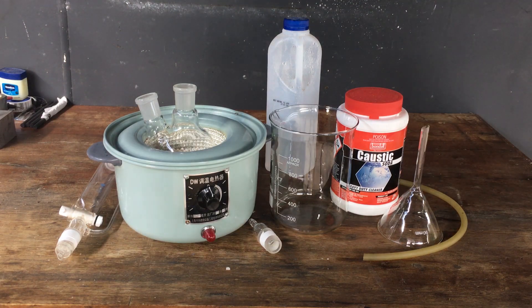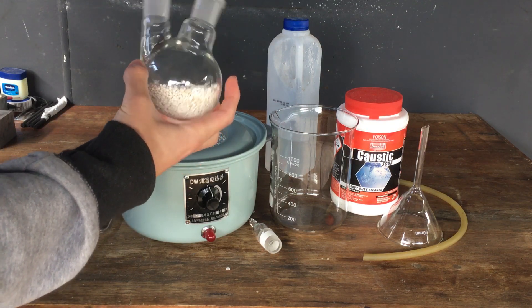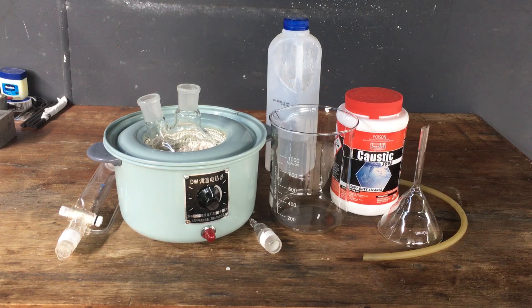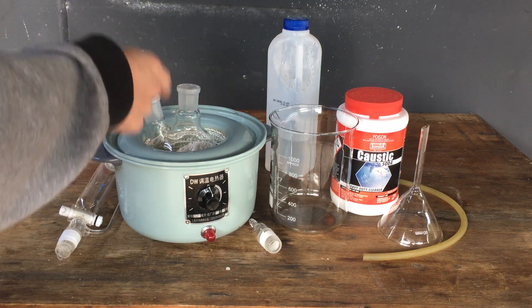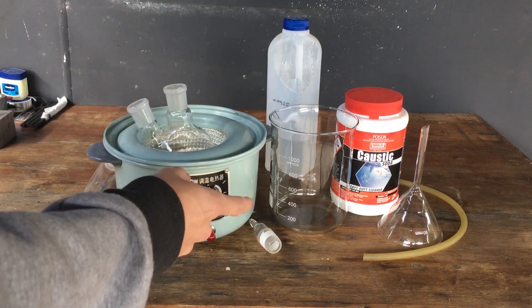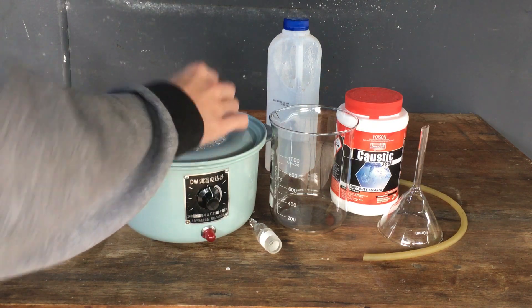Our reaction is going to be between ammonium sulfate — I've got a bit over 100 grams here in this two-neck flask — and we're going to be dripping a concentrated solution of sodium hydroxide onto our ammonium sulfate. That will liberate ammonia gas and a strong solution of ammonia in the flask. We'll bubble the gas that comes off through some distilled water, and later on we will boil the rest of the ammonia out of our solution.